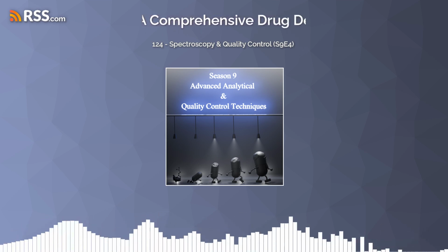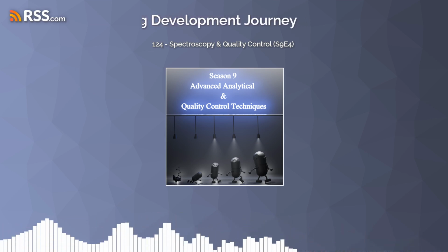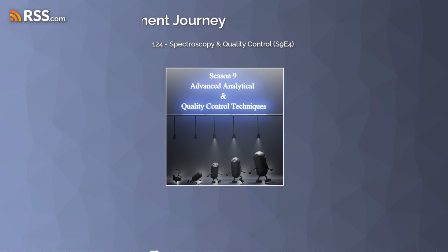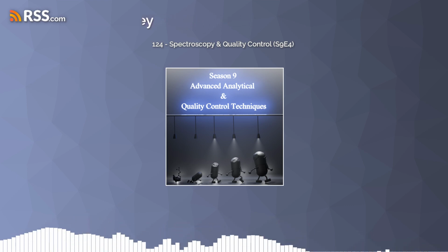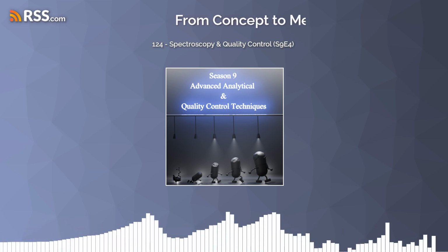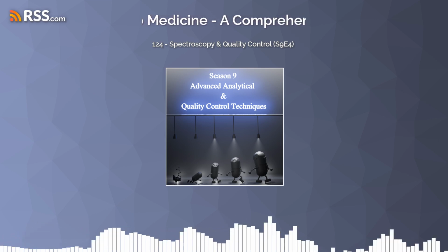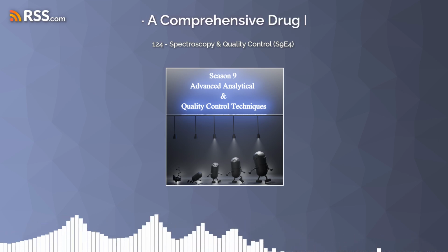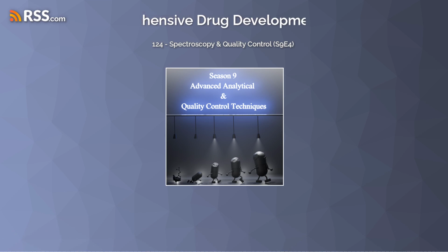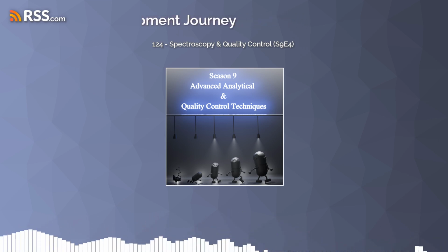Now, IR spectroscopy gives you a lot more structural information because it's sensitive to those functional groups we talked about. So it's better at identifying compounds. However, sometimes you need to do some sample preparation to get a good spectrum. And certain materials, like water, can interfere with the measurement. So that's something to keep in mind with IR.